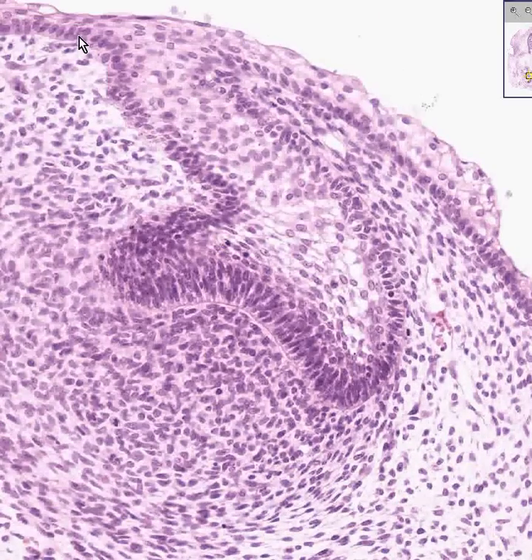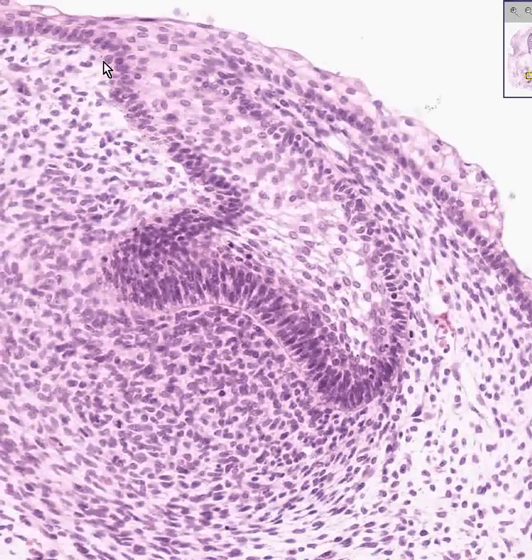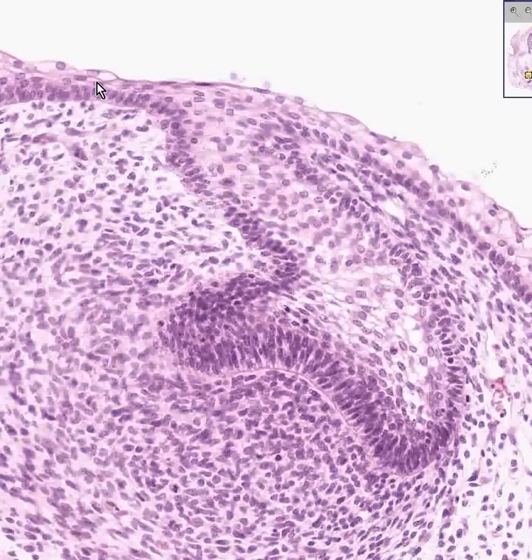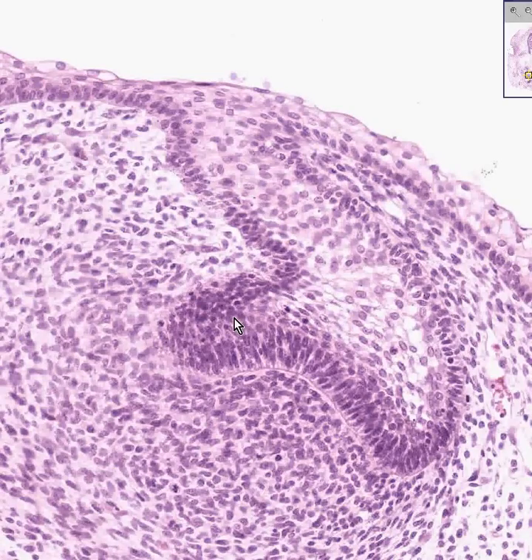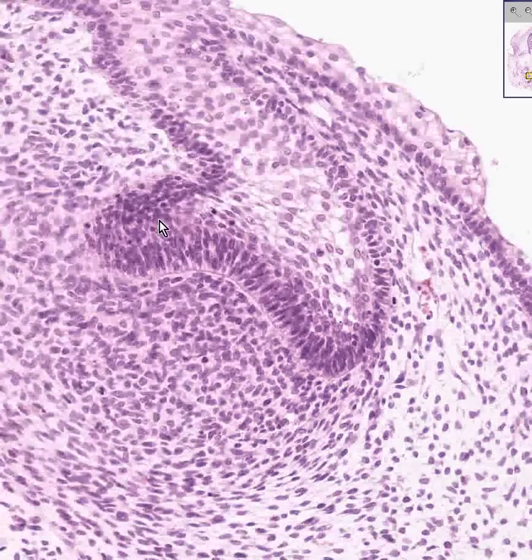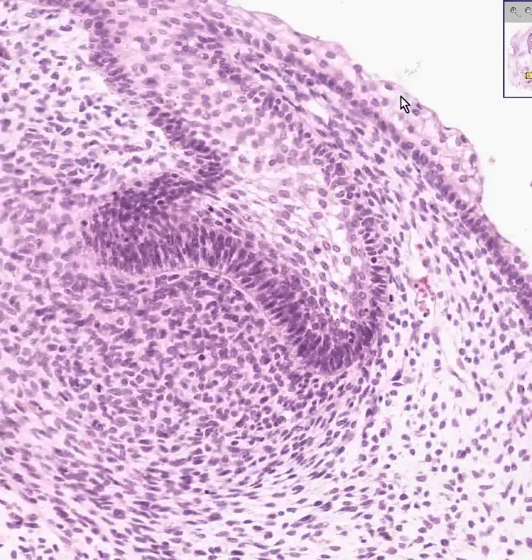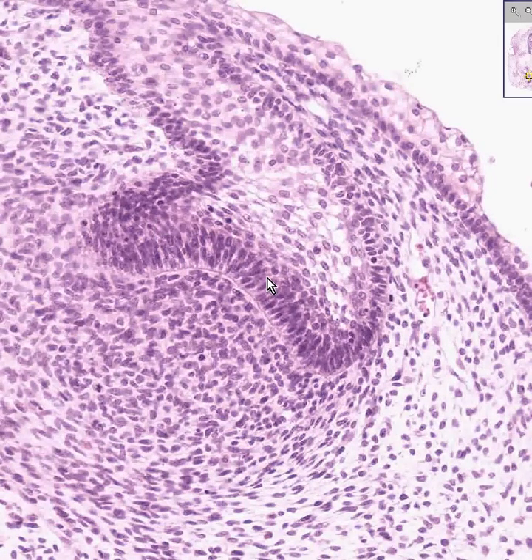The cells which are abundantly apparent here, as you can see them invaginating from the surface of the developing squamous mucosa, are tall cells. These are the cells which will eventually give rise to the enamel of the tooth. And these are ameloblasts.